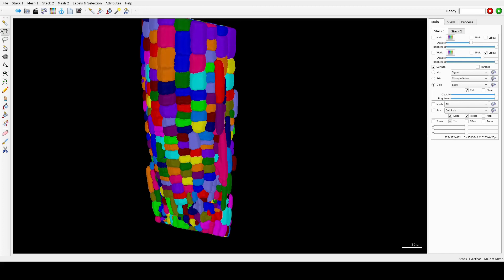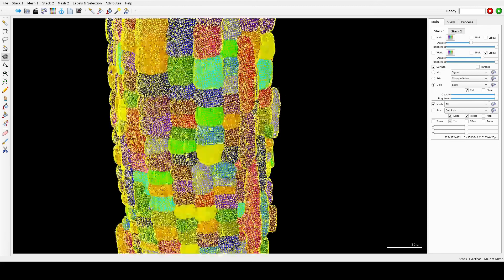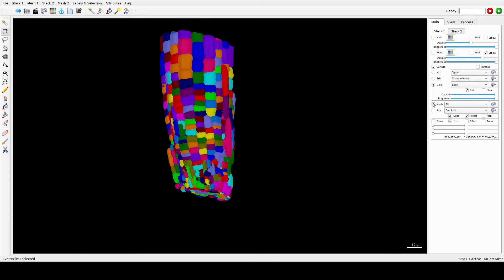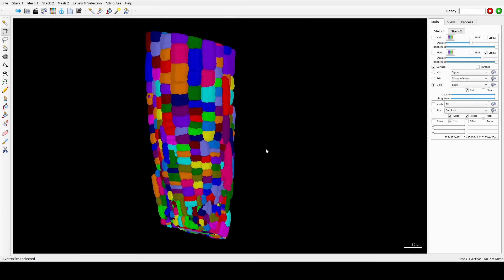If you want to select a single cell, you can use the Select Connected Area tool to see if you want to delete or modify it. You can always play with different values for blurring and the threshold parameter for the ITK segmentation or the CNN to check if you can nicely segment all the cells with as little manual correction as possible.